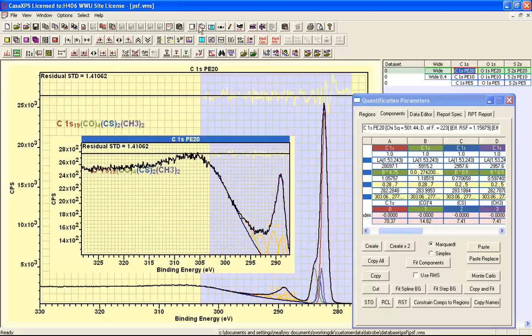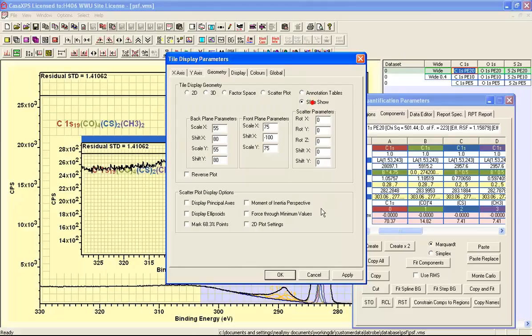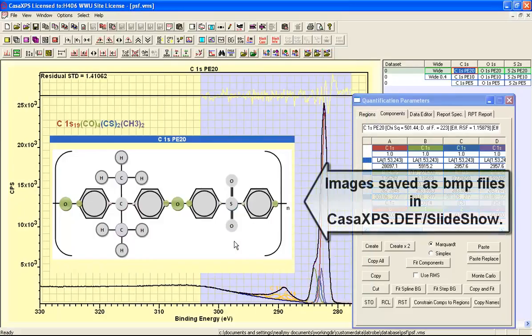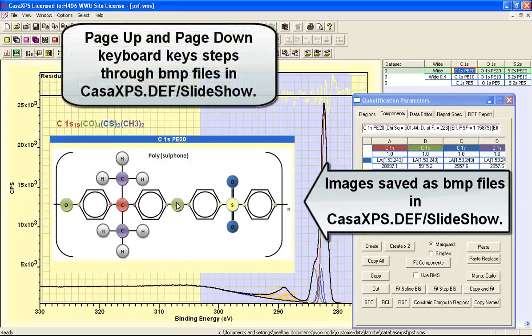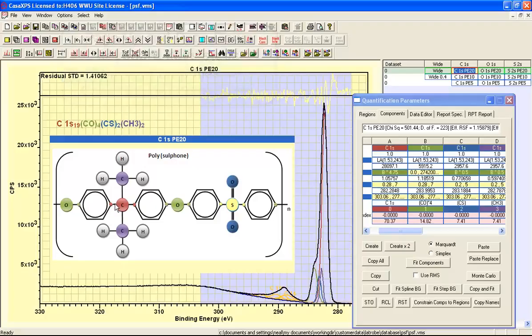that will represent, let me just display the slideshow again and go back to the original polysulfone description, that we've got 19 to 4 to 2 to 2. So this peak model would be consistent with what you'd expect for this polysulfone.